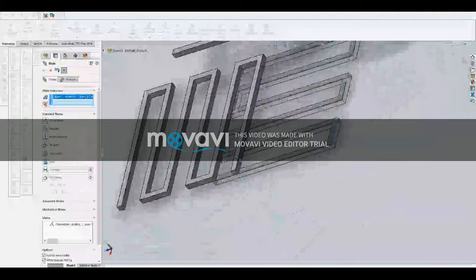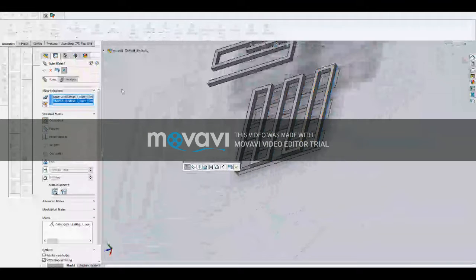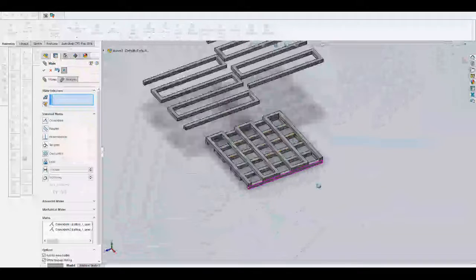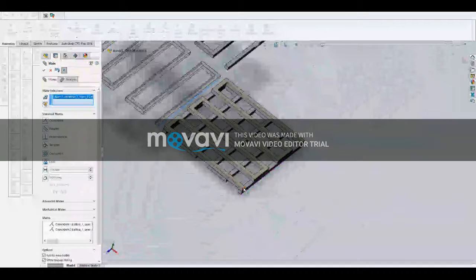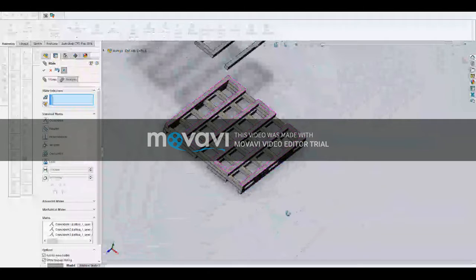It is also useful to mate a few other edges of the two lattices to make sure they are aligned. Repeat this process with each layer. Once you have finished mating each layer, check that everything is uniform. If not, you may need to add extra mates.